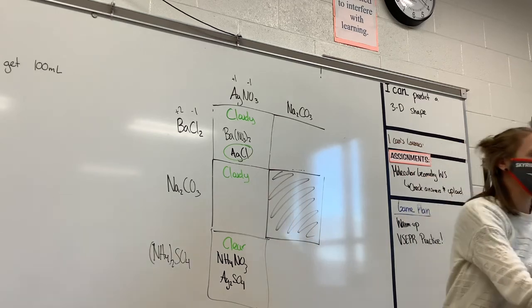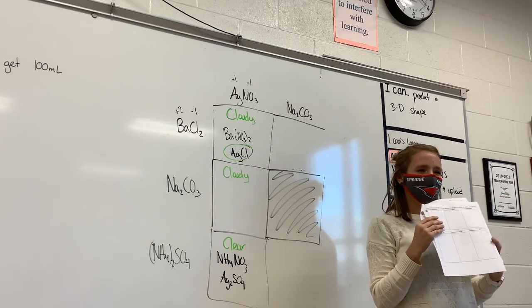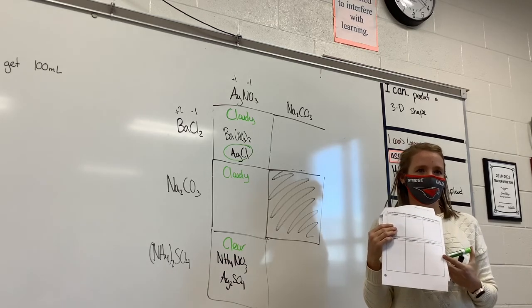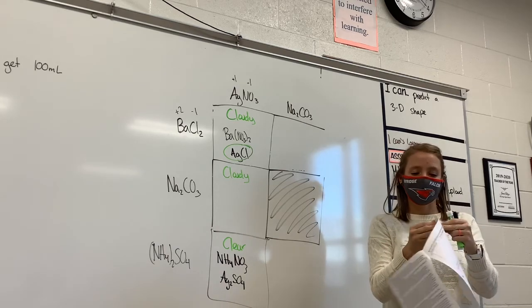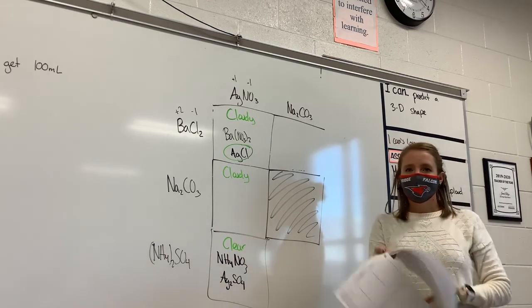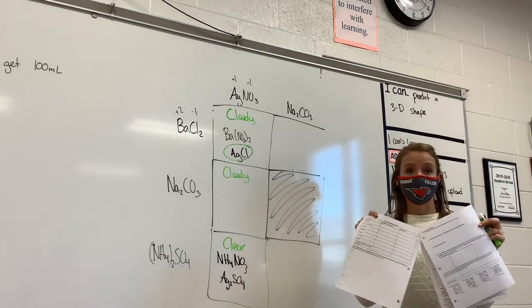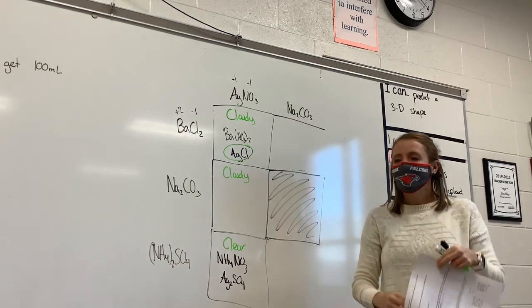And then you'll list them in the insoluble list here. Okay? Questions on your analysis? Once you get your analysis done, then you can answer the post-lab questions. Okay? There is no lab report for this lab. It's just completing the packet, so you don't have to do anything separate.